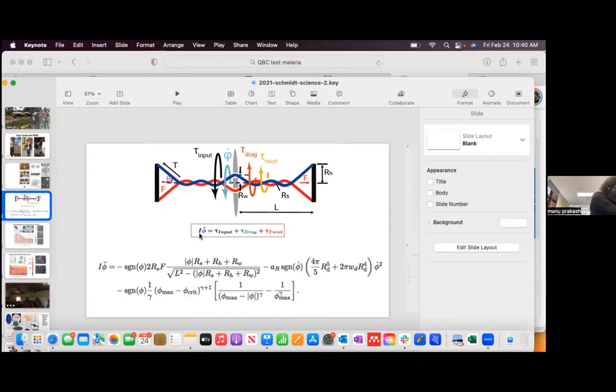So you said that there is no difference which way you should rotate the centrifuge. But in your pen centrifuge, there was like a ratchet mechanism to rotate one way. Yeah, that's a second one. So this is the handifuge. It's a different object compared to that, and then I'll tell you why. We did that because we can in that mechanism.